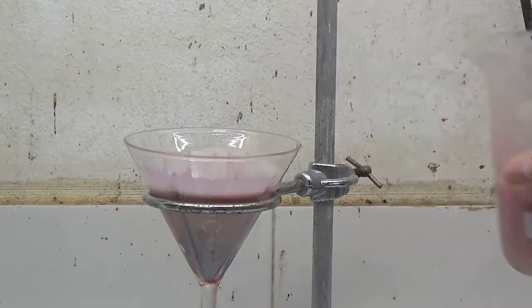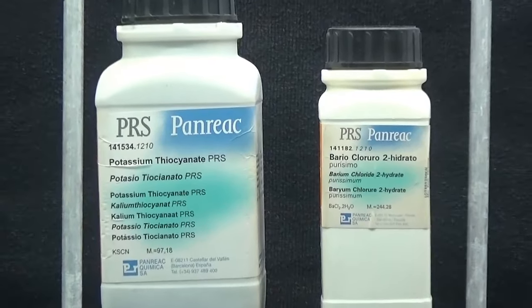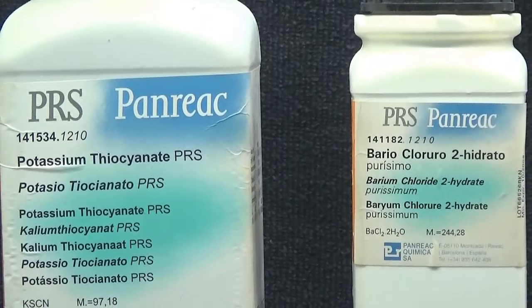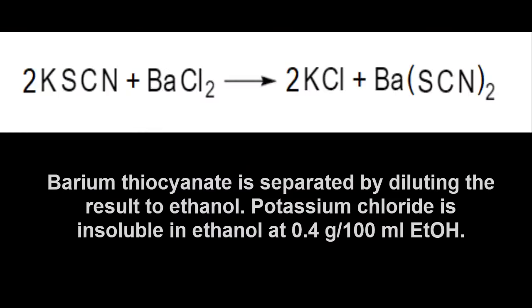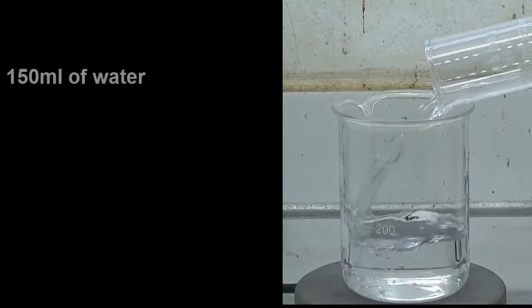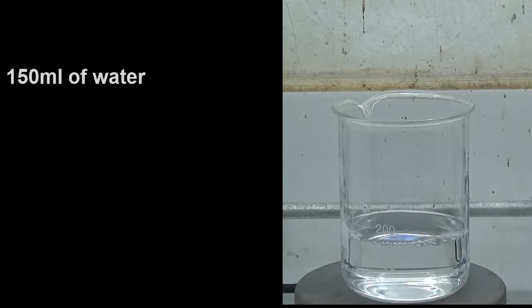For this synthesis, I did not have barium thiocyanate. I had to figure out a way to do it with the reagents available in my laboratory. Having studied the physical properties of barium thiocyanate, I found that it is very soluble in ethanol and I decided to obtain it by combining barium chloride and potassium thiocyanate.